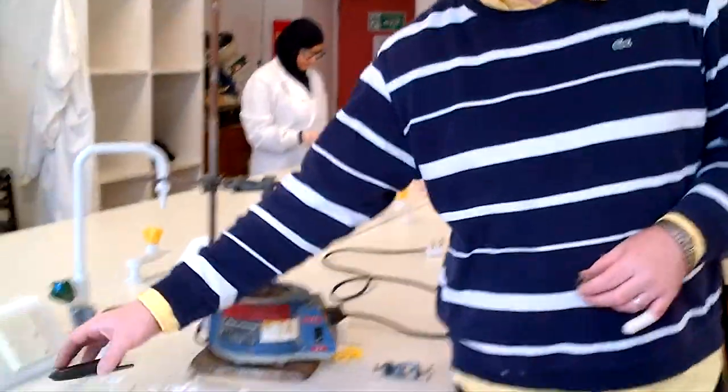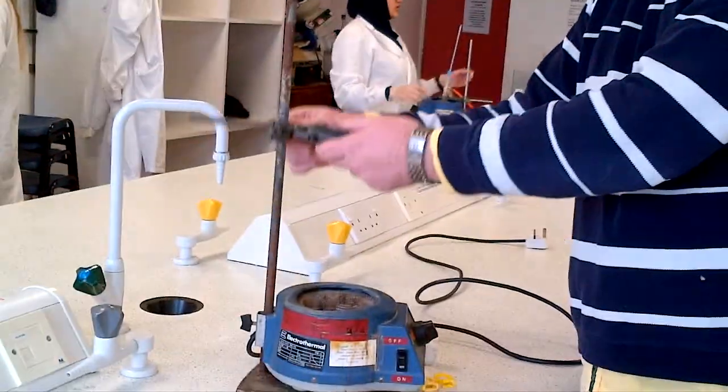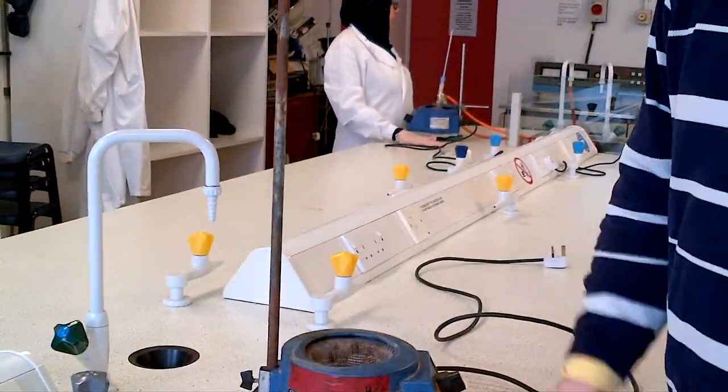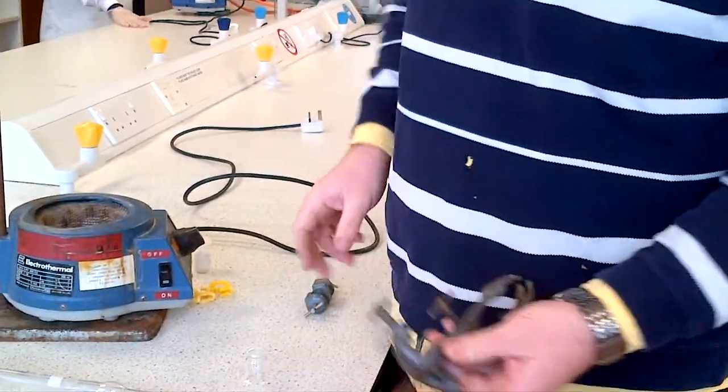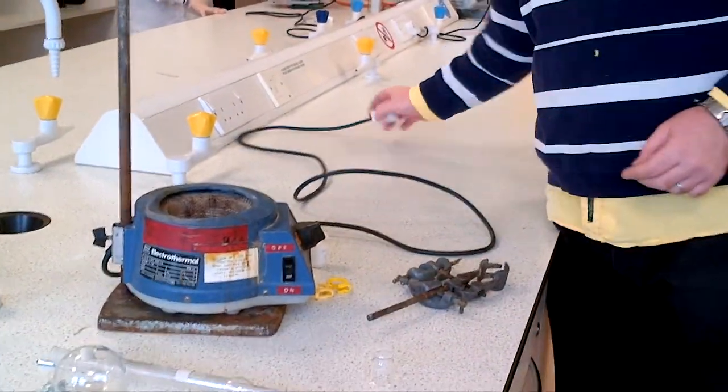This is an example of how to distill. What you would need at this point for distillation is a stand, a boss and clamp, another boss, and a heating mantle.